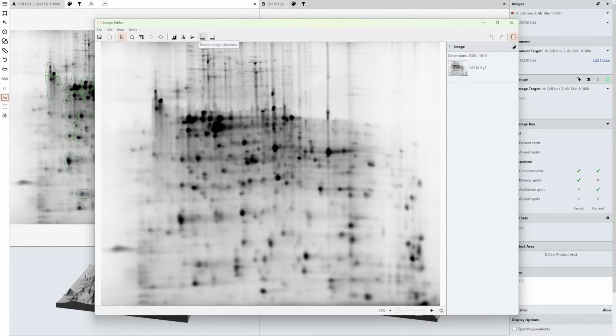All this information that you wouldn't want to clear off, but may be accidentally removed by using other image editors that weren't made by TotalLab. So using something like PowerPoint or Photoshop, they're not scientific programs. They're not designed for handling scientific data or scientific images. So they may just go along and delete all your metadata, not thinking it's useful. But it is actually really useful and really important for the history of an experiment.